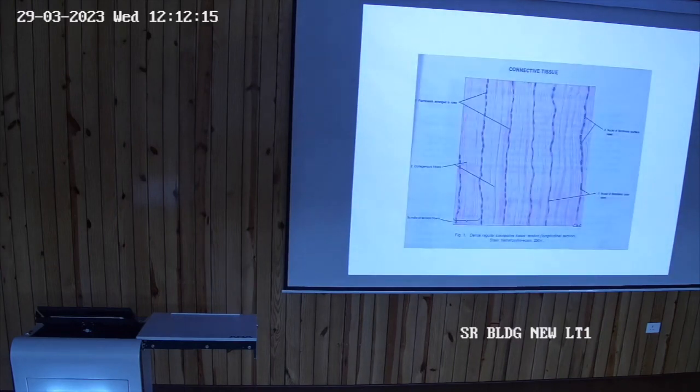So, to differentiate this, I will come to another point. In skeletal muscle, you will see the transverse striations. That means transverse lines like this, horizontally, which are named striations. So my point is this: see the slide carefully. Check each point.